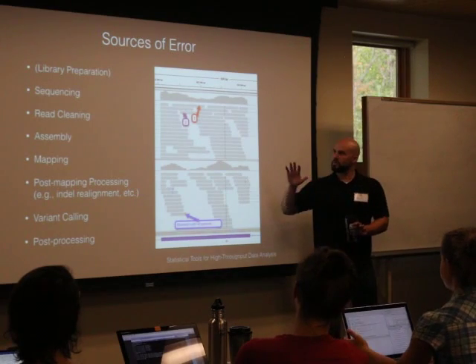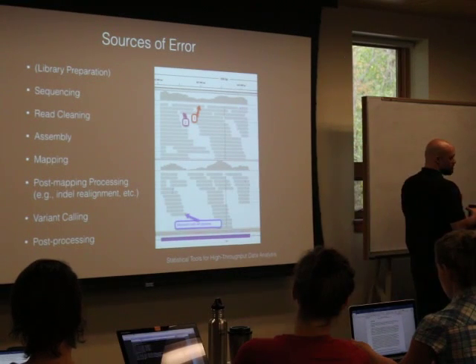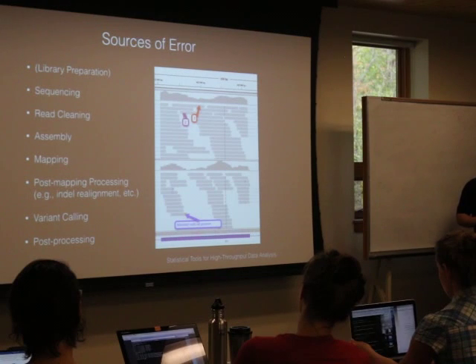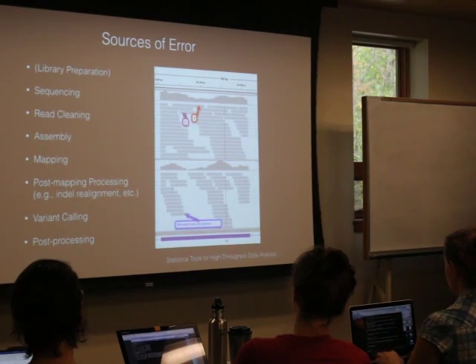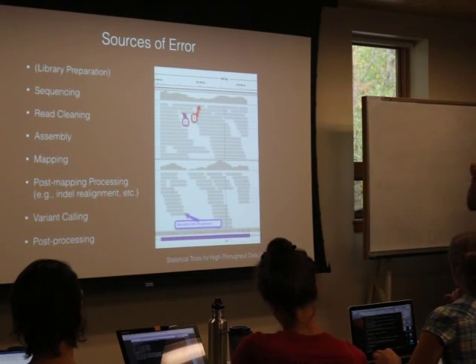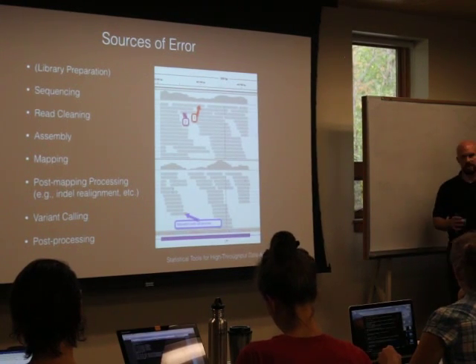We spoke a little bit about sequencing and library preparation yesterday, from first principles and RAD protocol stuff, things that Mike and Paul went over previously, and maybe you've done in some of your own data set generation. You can inflate your duplication rate, and that can have informatic and biological interpretation consequences for your data. How you do your sequencing matters, whether you're dealing with a random distribution of fragments across the genome, or you're subsetting particular fragments.